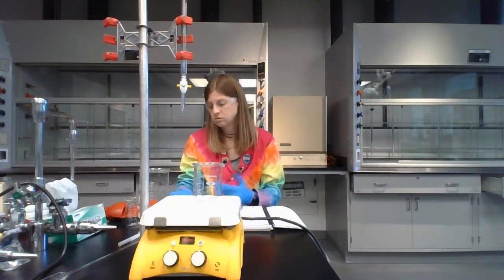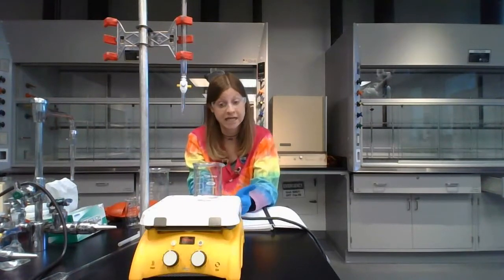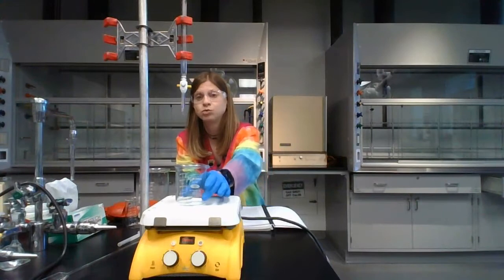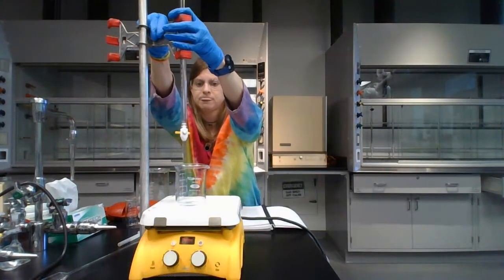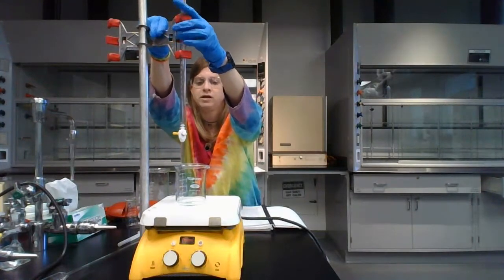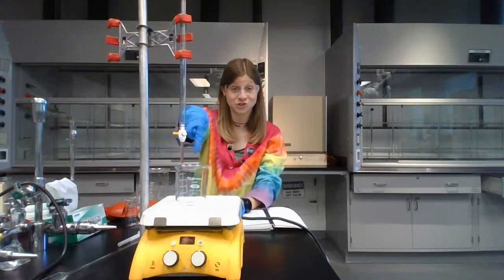And so once a solution gets to 70 degrees Celsius, you can start your titration. Now, it still has to be on the hot plate, and the hot plate still needs to be warming it, because while you do your titration, it has to be still between 70 and 90. So you'll have to arrange this to where the burette is directly over the beaker, just where the beaker's a little bit inside of that. The stir function is on, so it's stirring.